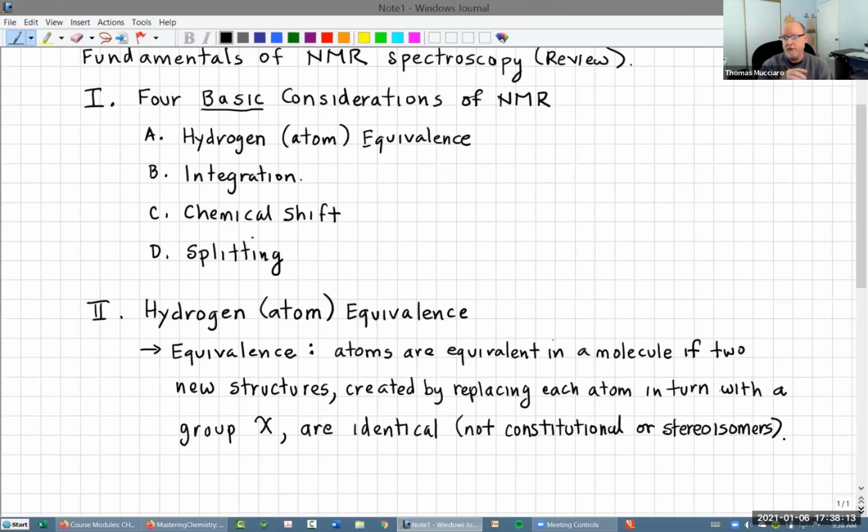There's one exception to that. We're going to talk about all of that stuff in more detail because there's some terminology and definitions tomorrow, okay? There is another way that hydrogens can be non-equivalent. It's also a three-dimensional effect. We're going to talk about it tomorrow. They can be not magnetically equivalent.